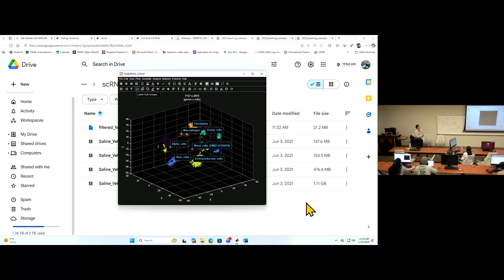So in the whole semester, we will study a lot of those functions, underlying principles, and how the algorithm works, how this unprocessed data will be cleaned, clustered, annotated. If you have two samples, how they compare, how the network will be inferred, how the differential expression, differential variability, all the analysis will be conducted. They all are in the manuals. Some of those commonly used will be given as buttons, but the principle behind will be given during the lectures. Okay.